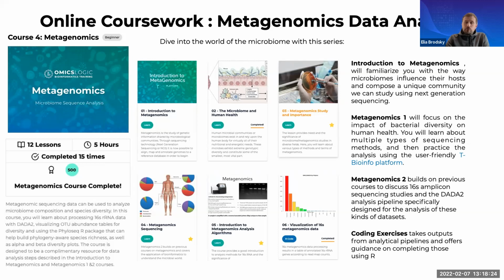And number three, you will need to practice and learn how to analyze the outputs or the tables and visualize them. Today we'll take a look at some very basic examples, just to get started: how to load in such data, how to visualize it, and how to interpret it.